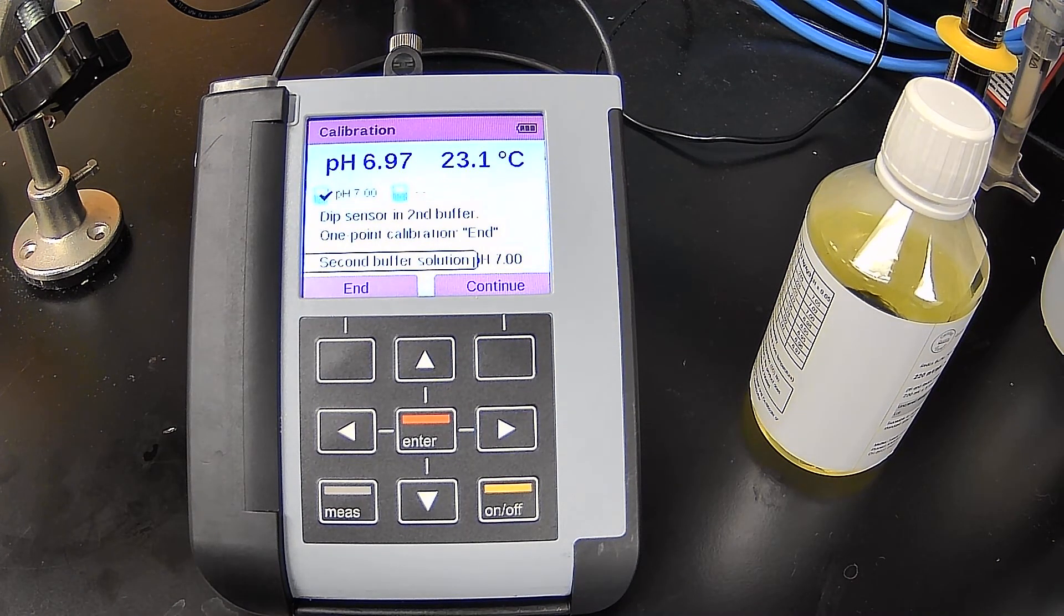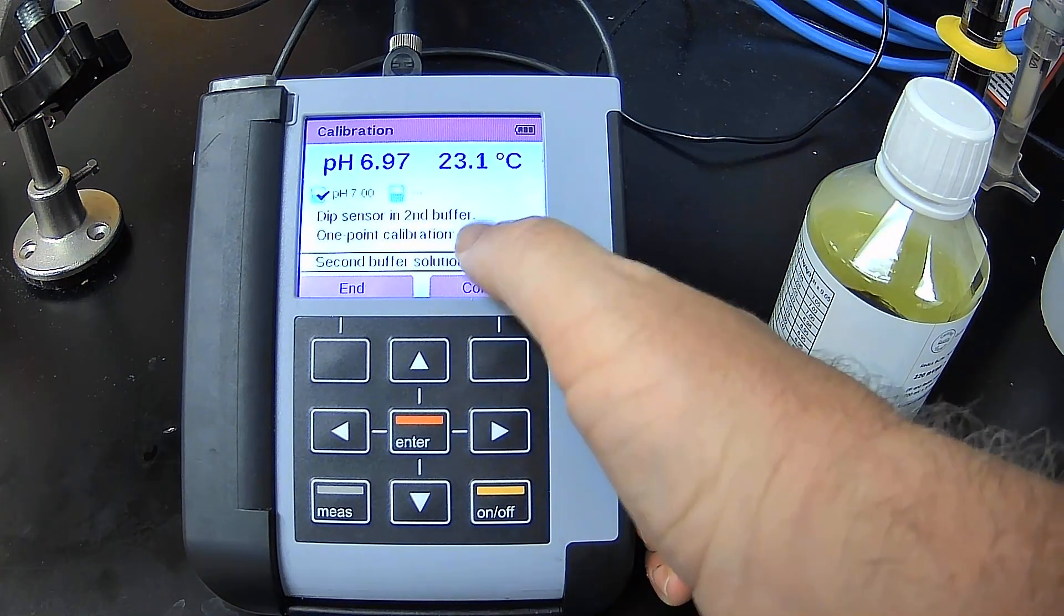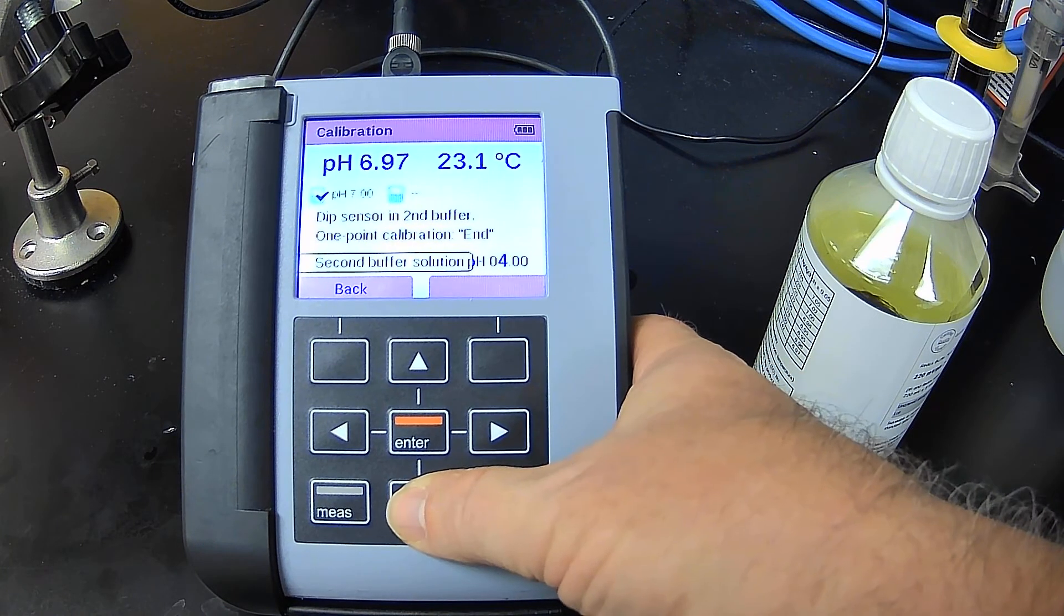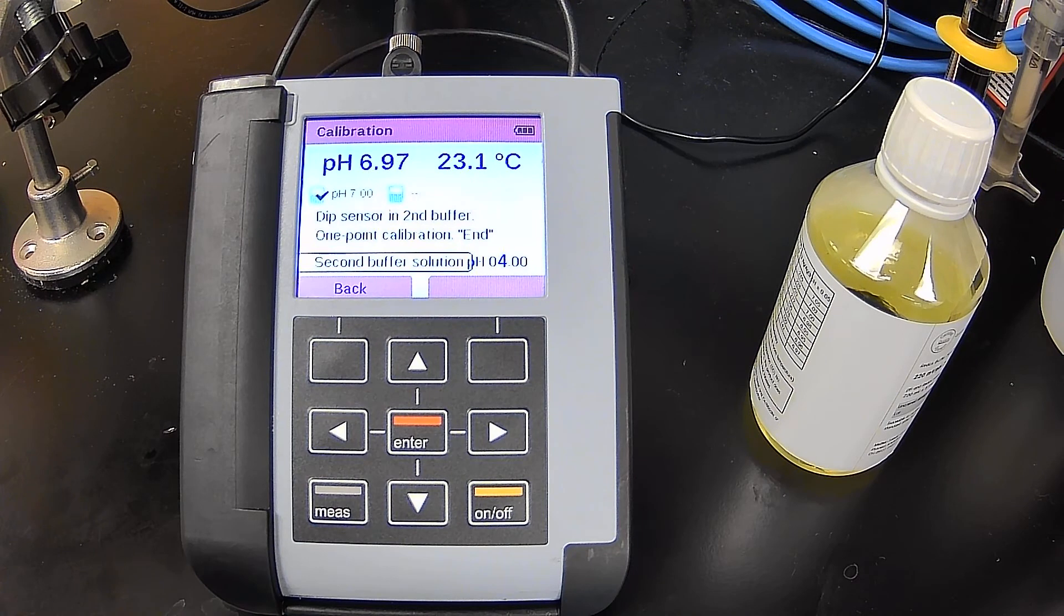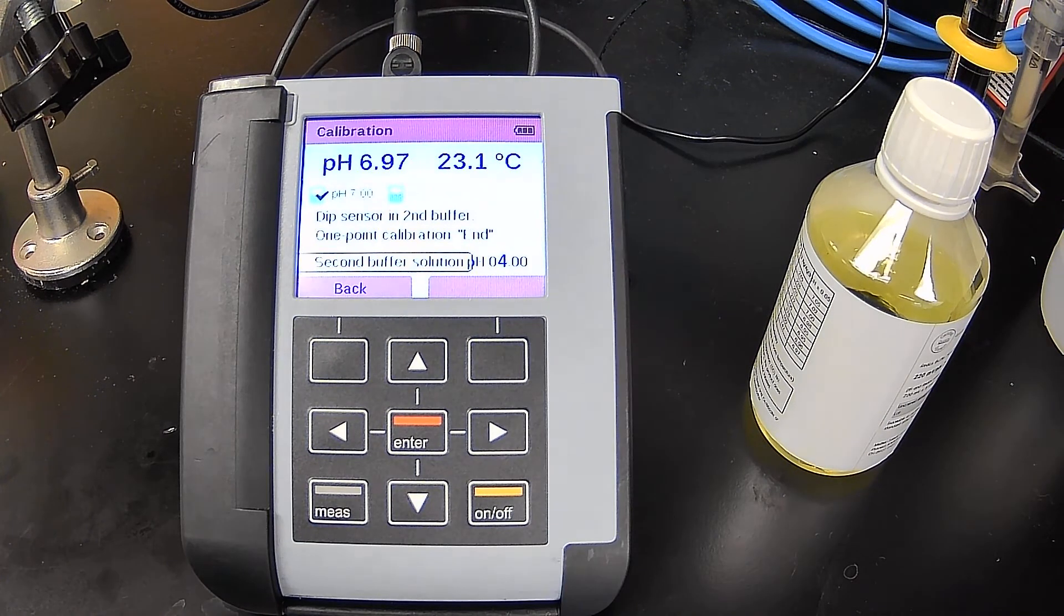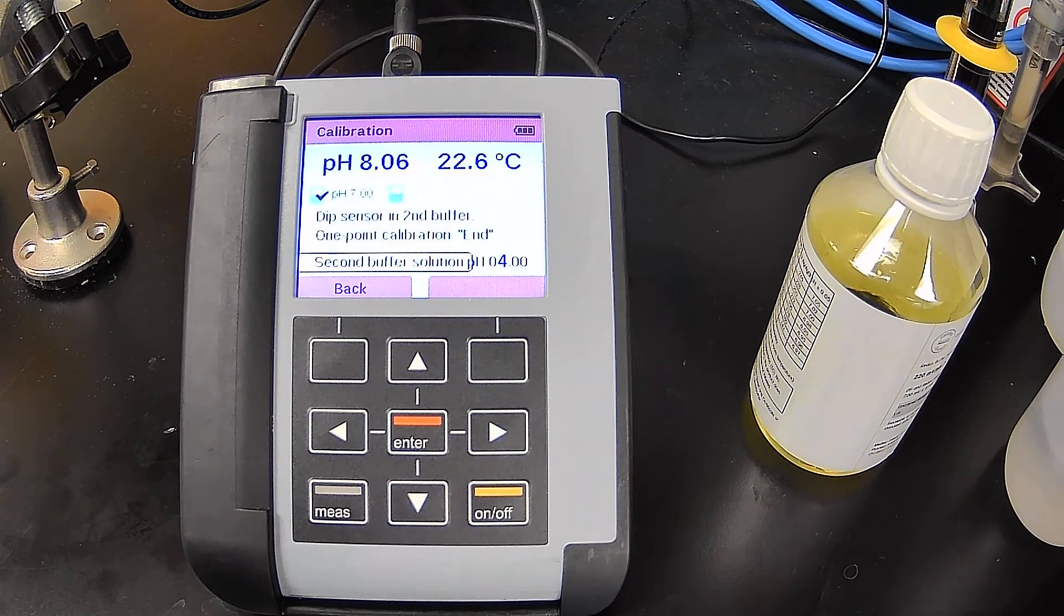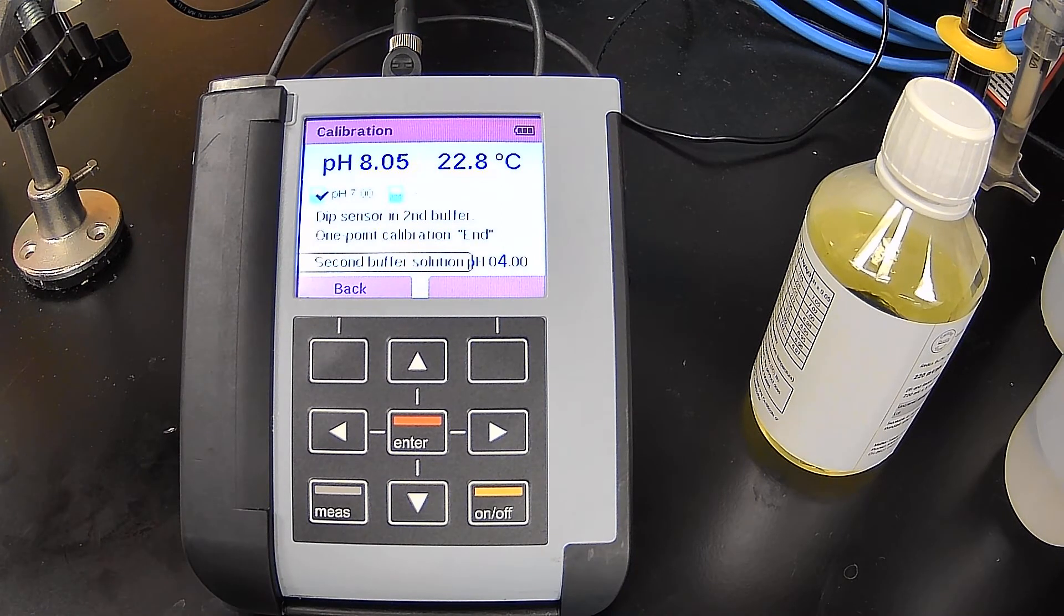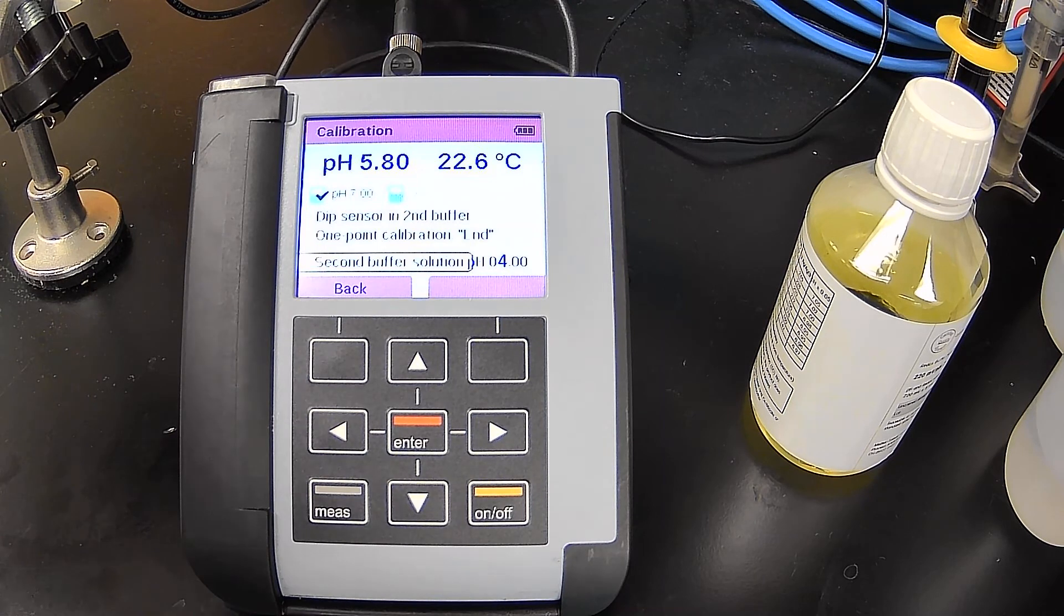Okay. So it's telling me go ahead and dip sensor in the second buffer. So here, I'm going to go ahead and enter a buffer 4 and I'm going to remove this from the buffer 7. I'm going to wash it. So what you can't see is I'm using some DI water to wash off the electrode. I'm going to remove my buffer 7. I'm going to go ahead and dip the electrode into a buffer 4.